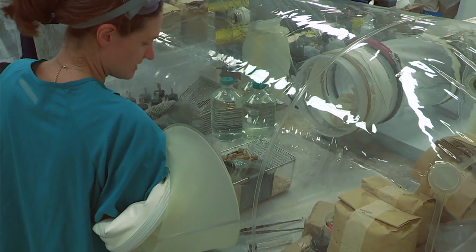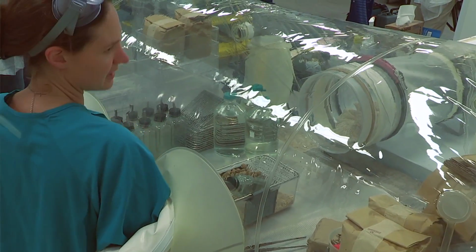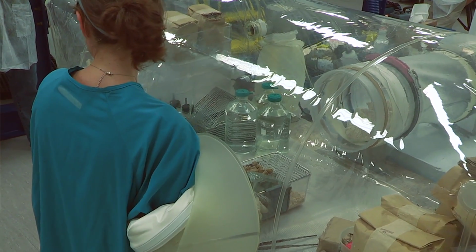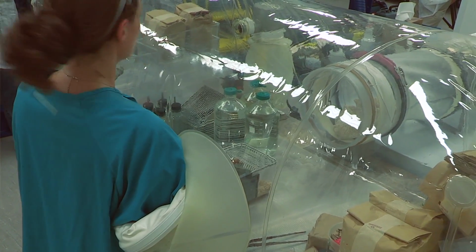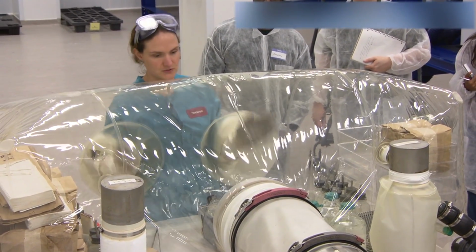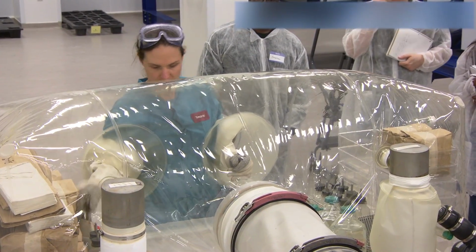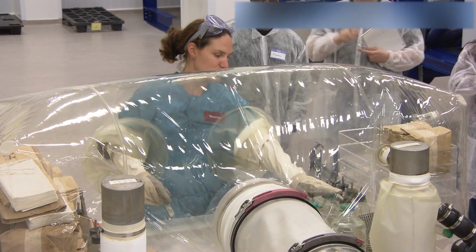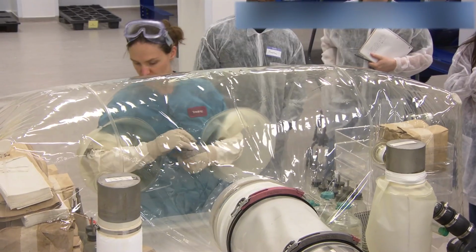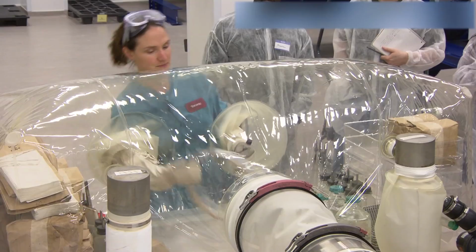And by that point in time, when you've finished up your culture tube, most of your cages have been cleaned. We clean into the, because we don't do complete cage changes, these cages always stay in here, so we'll place all of the refuse into a paper bag, and then the paper bag with the refuse will get exited. And we'll just fill up with our fresh water. Any dirty water can just be poured right into one of these and exit that out too. So any refuse will just send right back out.